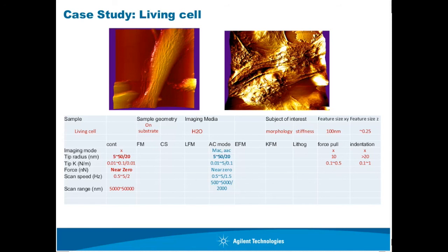So I don't know exactly what the sample is. I could check later, but let me make a guess. You say grain boundary, like defects, and these defects are actually mixed up with other roughness of the sample. So the grain boundary is some sort of defect, or some sort of roughness. Your sample is also some sort of roughness. So here's the difficulty: how do you tell the difference between one roughness and the next roughness?